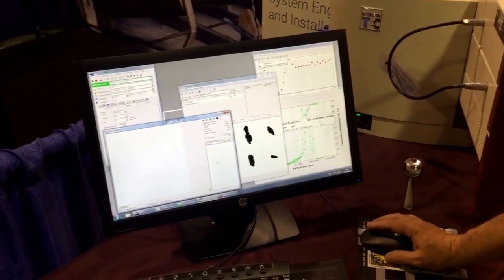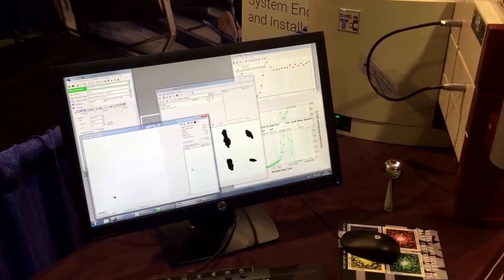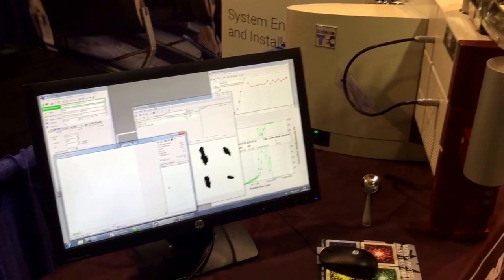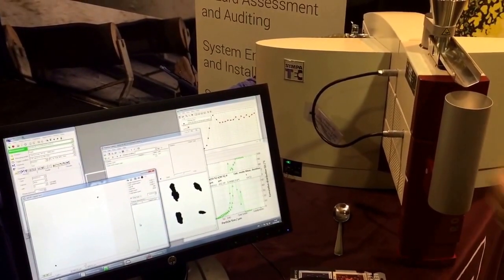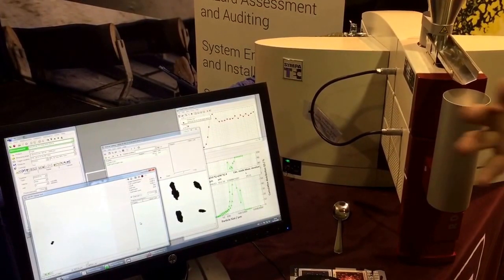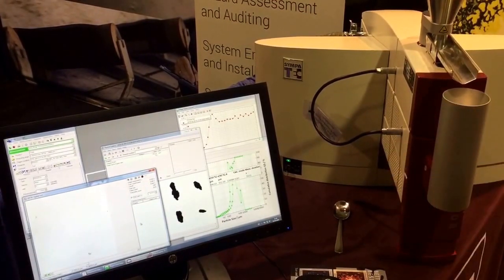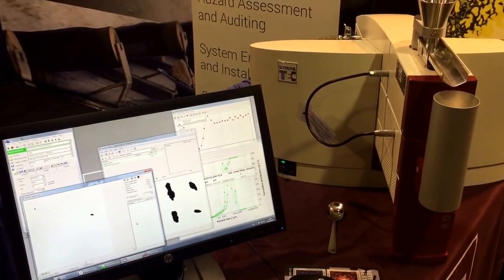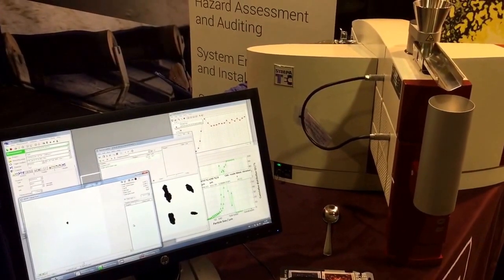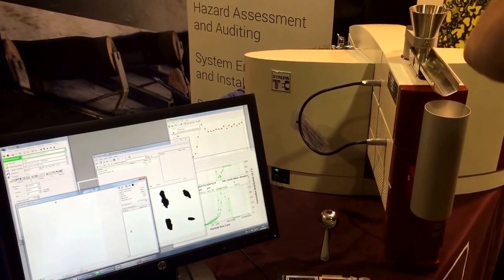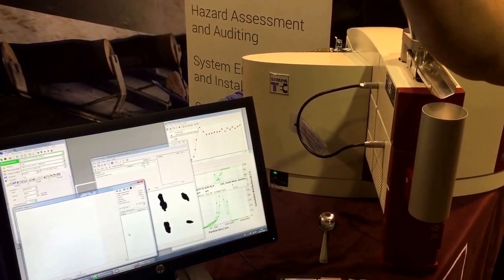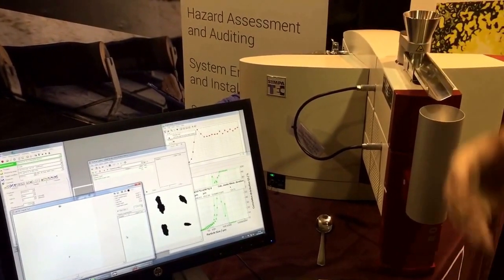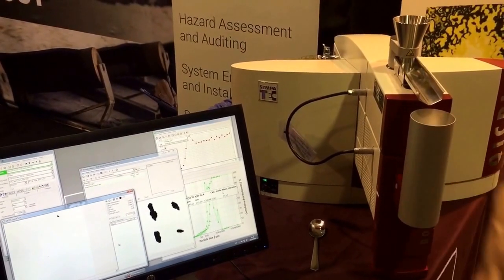What we're doing is I've got a compressed air source back here. So I'm adding it to an aerosol stream and I can control that pressure. When that material hits that aerosol stream, it's a change in centrifugal force that separates them.